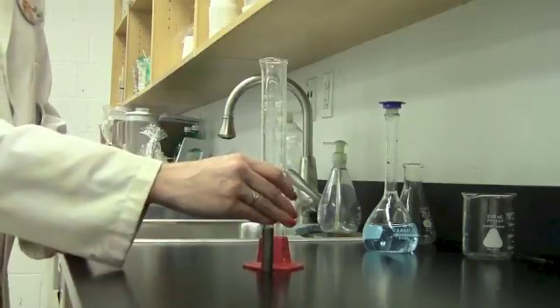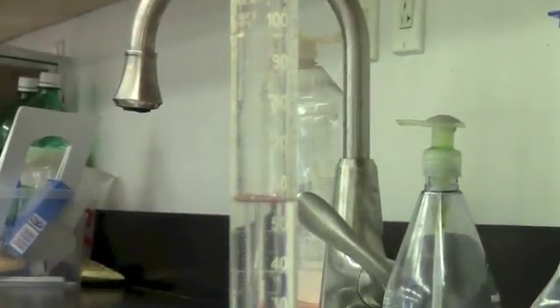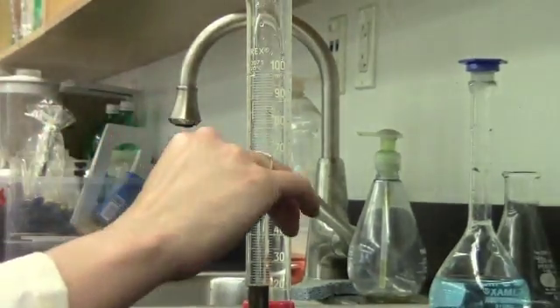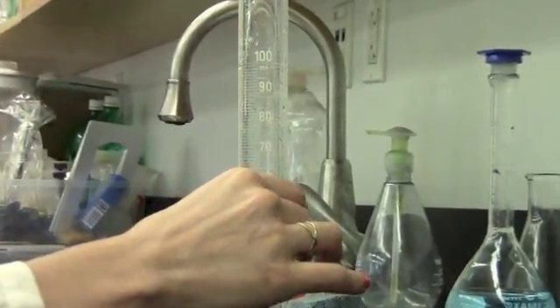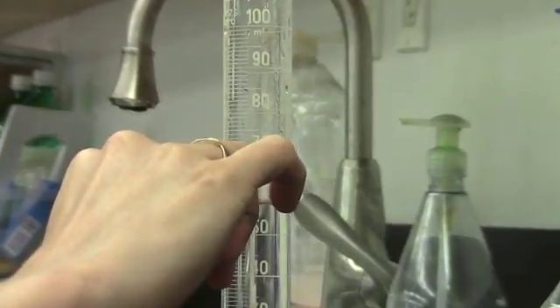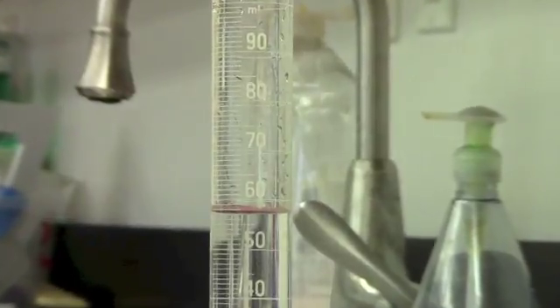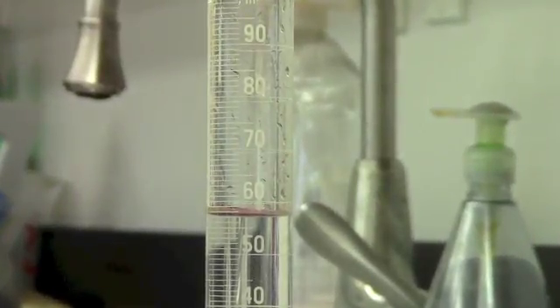Now I'm going to take a precise reading of the initial volume of the water in the cylinder. Again, get on eye level with the meniscus. And I can see that this is between 57 and 58. So I'm going to call this 57.5 milliliters of water.